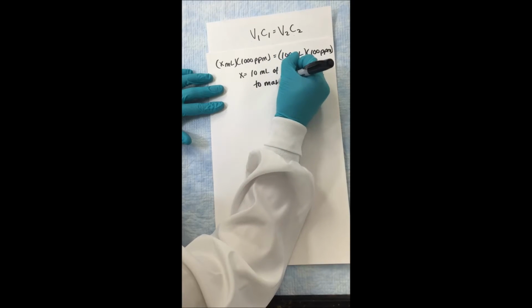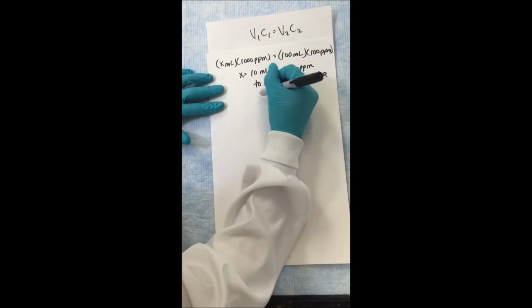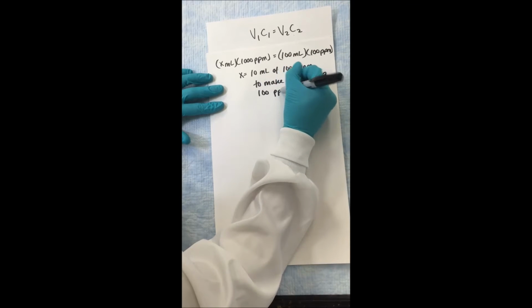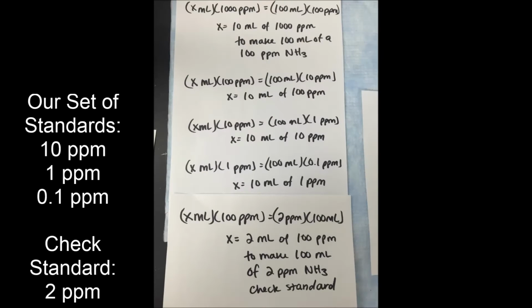Starting with this 100 part per million concentrated solution, we are going to serially dilute down to our 10, 1, and 0.1 part per million calibration solutions. Our calculations should look something like this when we are done.